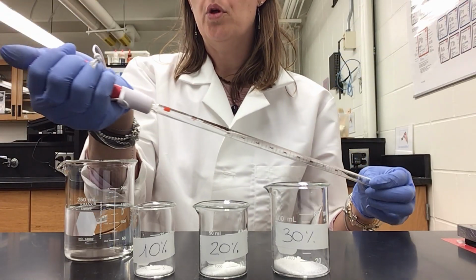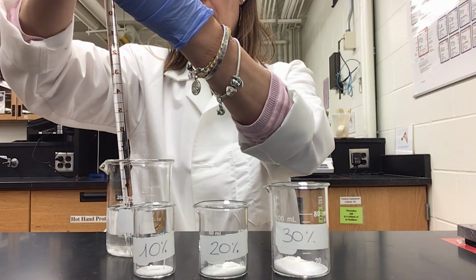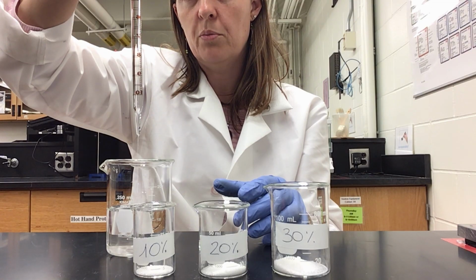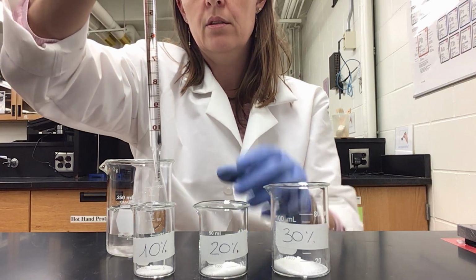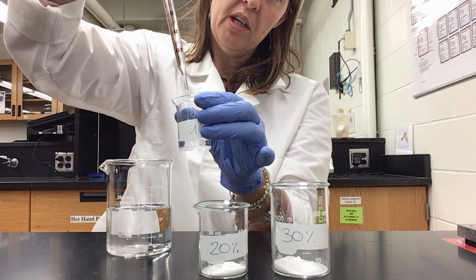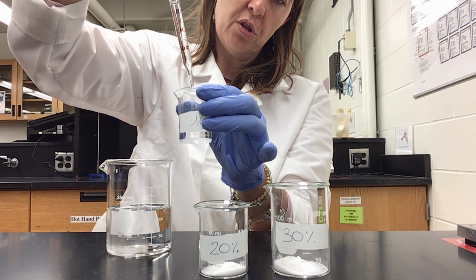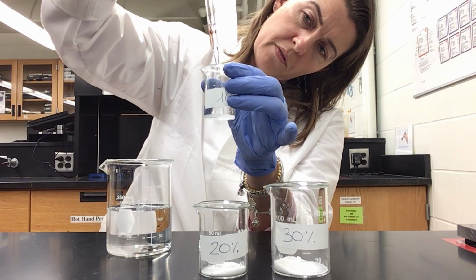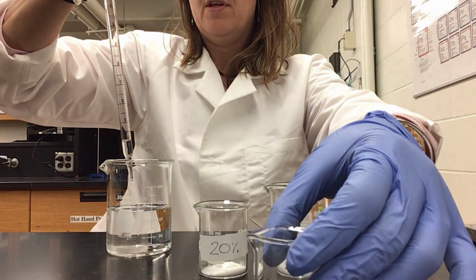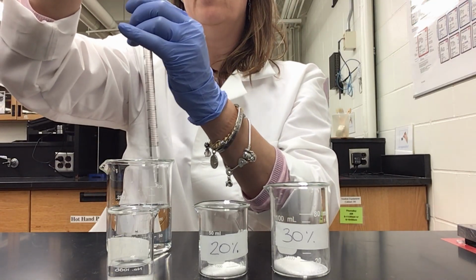So, I'm gonna squeeze, put it here, it goes up, up, up, up, and use my thumb to bring it to 0. Look at the meniscus to be precise. There you go. And now drop it to here, up to 10. Remember that the tip of this pipette doesn't contain the volume that we want. So we need to stop at 10, okay? Very carefully, almost there, almost there. There you go, stop. So now this is ready, and I just need to add 3.52 milliliters more.